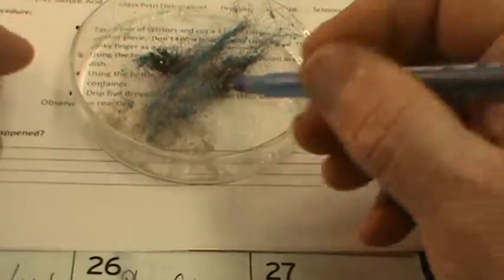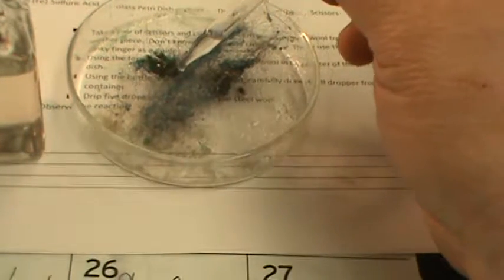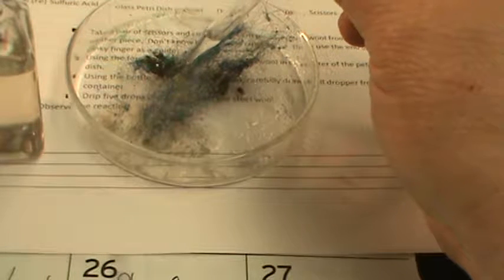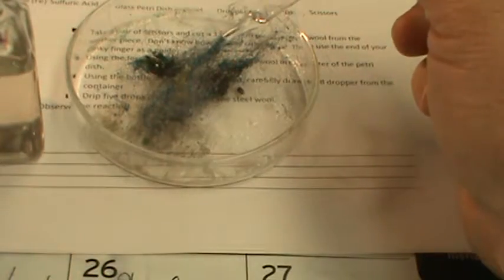Now for the next one, we've got some steel wool. In this case, it's a Brillo pad, so it's got a little bit of soap on it. Soap is a base, so it's going to neutralize the acid. So I said, let's just see what happens when we put the acid onto the soap. And as you can see, I'm getting kind of a yellow-green color right there.